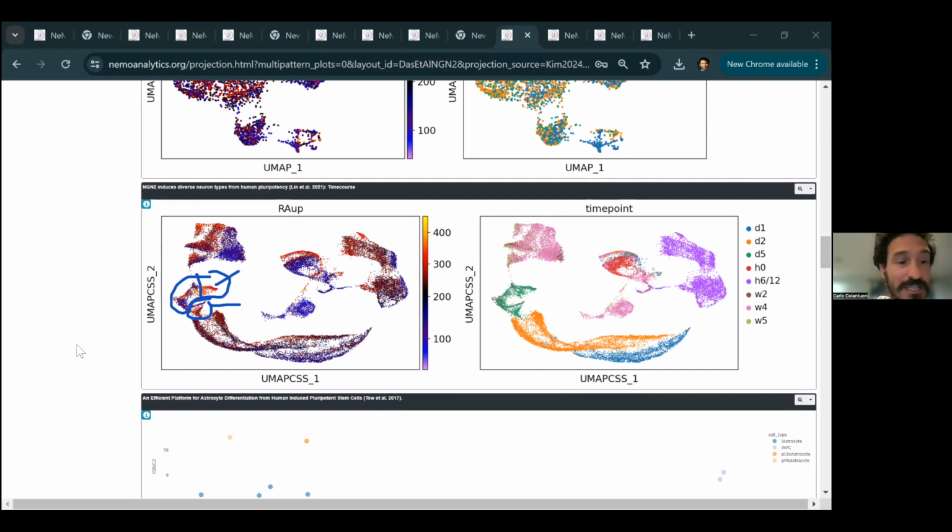So it's trying to put together two very, very simple things to be able to ask lots and lots of questions. Get the data together, and then get your hypothesis-driven or question-driven gene list together. And it really does depend on what data is there, obviously. And that's why I'm really throwing out the invitation and hope people start to get their own data in here, because that's when it becomes powerful, when we can really look across a lot of data.